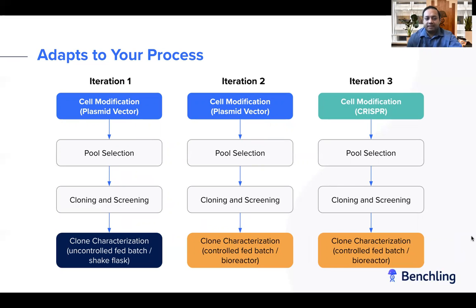This is an illustrative example of part of a cell line development process, and it reflects the constant iteration and evolution that these specialized teams see on a daily basis. So, in an ideal world, the data model, the process, and the workflow should be configurable in a low to no code environment. So, companies can iterate and evolve quickly without being resource intensive or overly dependent on their digital partners.